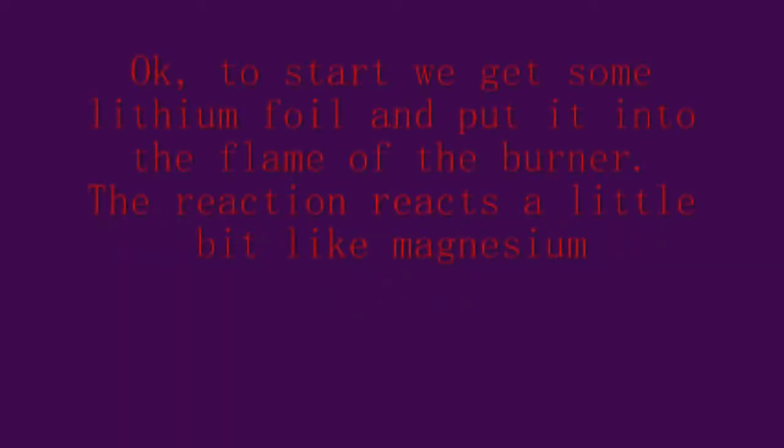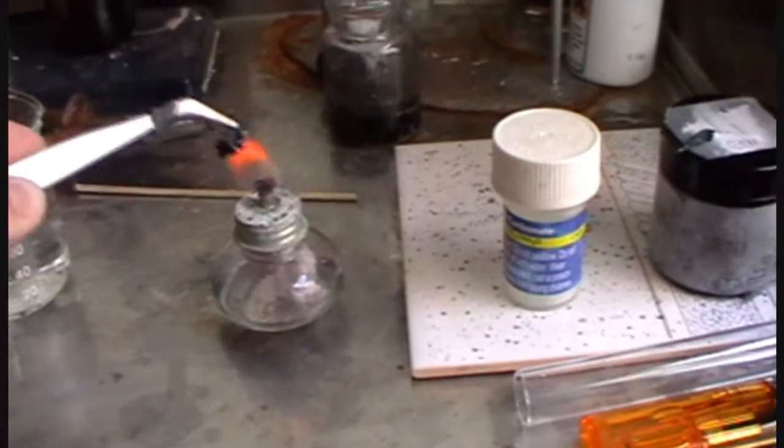Lithium chemistry. To start, we get some lithium foil and put it into a flame of a burner. The reaction reacts a little bit like magnesium.